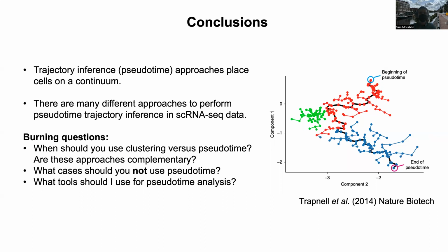Okay, you have a question? Yeah, so back when you were talking about the benchmarking paper, you brought up the capability of some pseudotime methods to analyze disconnected lineages. Why would you do that instead of just re-embedding your known lineages, or your connected things, if you're lazy, I guess?